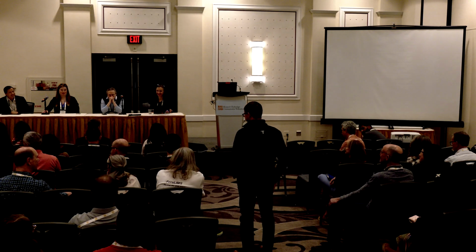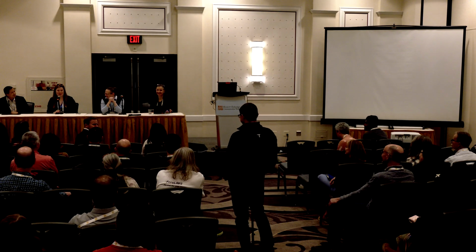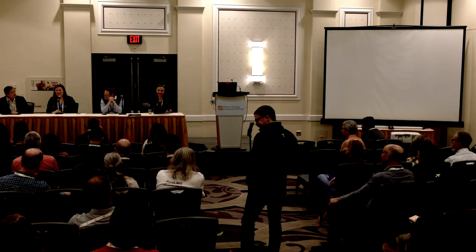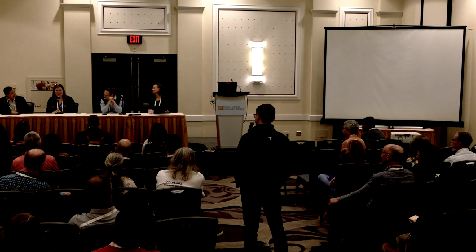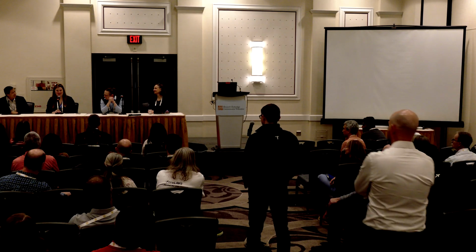Slight change. I'm in a genomics core at Dana-Farber. We get lots of requests of "I need my data tomorrow," and then we post that data for them tomorrow, but they don't collect it for 6 months. Do you have any strategies? Mine is, we need the data tomorrow, and then 6 months later they say, oh, there was an error in my sample sheet. Can you re-demultiplex it? It's all wrong.